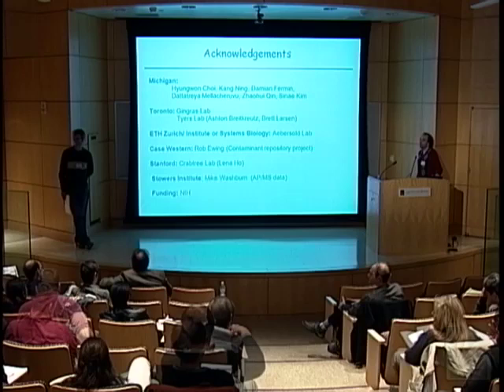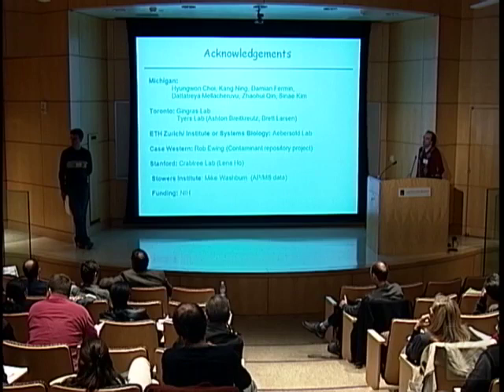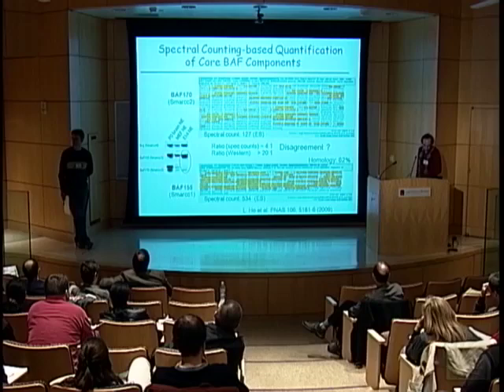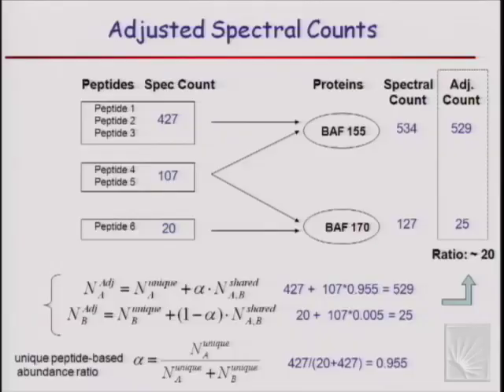The last one, I think you showed the ratio between your new method using the peptide property to determine the ratio between two cases of a protein. And I think you showed that your ratio was more accurate to the ratio found. Right, spectral counting, you mean, okay. When you extend this algorithm, how are you going to identify the significance of change between one state versus the other, because ratios are obviously not very accurate.